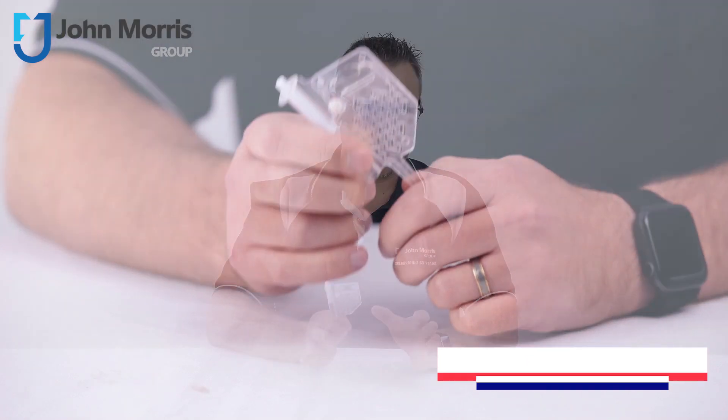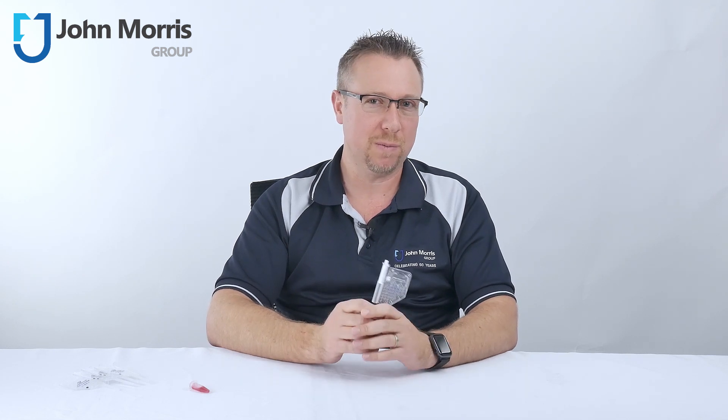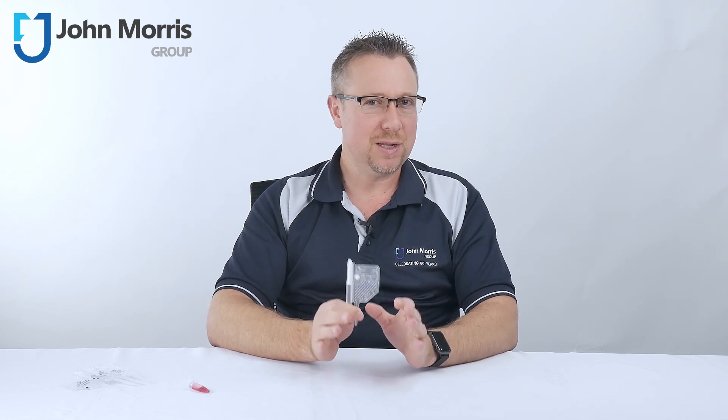So why is this all so special? Well, if you're doing cell counting, you're already quite familiar with pipetting, staining and manual handling of your cells, and if you feel this can be quite time-consuming, inconsistent and perhaps even causing a bit of inaccuracy, then this might be the solution for you.